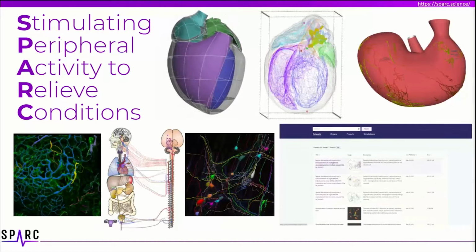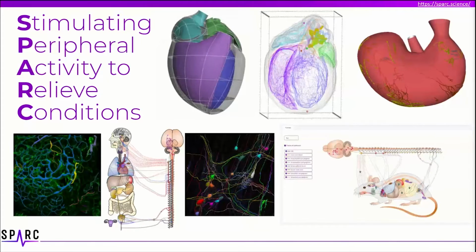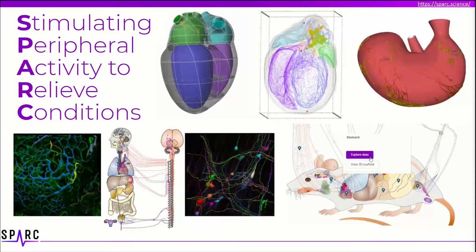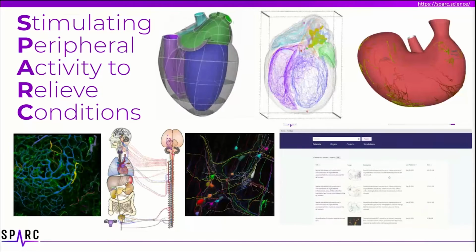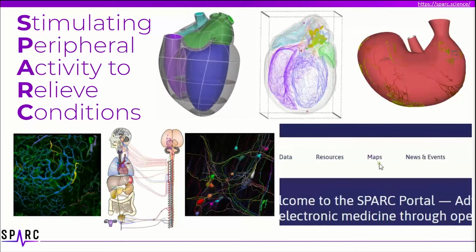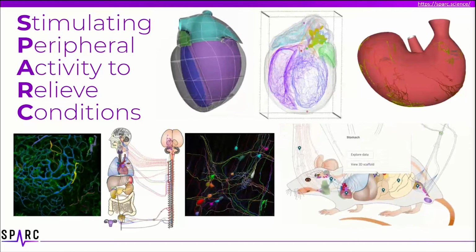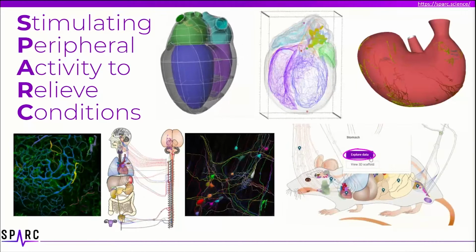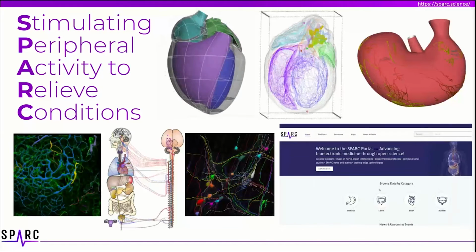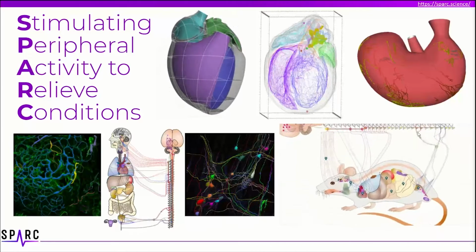The functionality in MBF Bioscience software will soon be rolled out to the broader scientific community. The SPARC program aims to accelerate the development of therapeutic devices that modulate electrical activity in nerves to improve organ function. The program has built a web portal, sparc.science, that hosts open data generated and curated by SPARC to encourage the reuse and further accelerate scientific discovery.